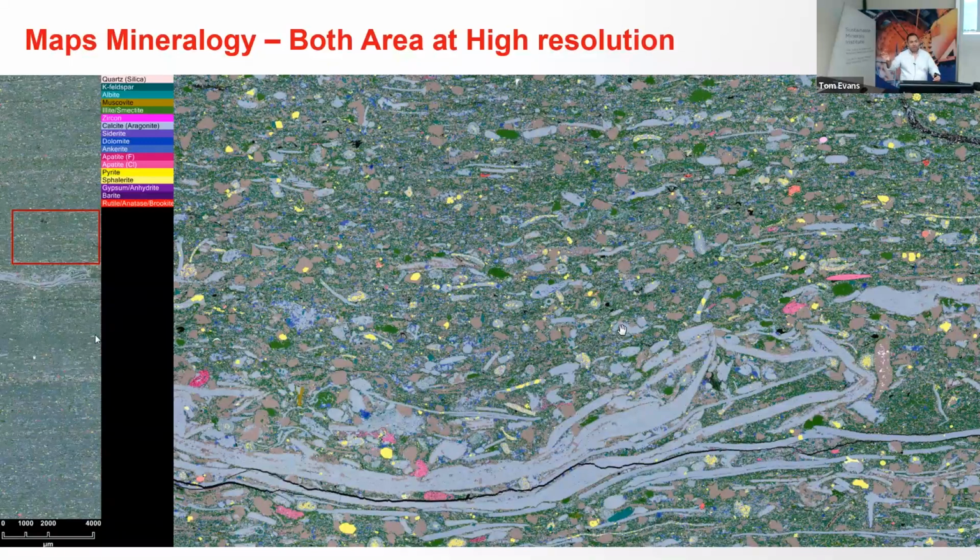And that's the reason we are working on a lot of automation to basically go through the entire workflow in a more automated fashion. So even though the classification takes longer and we are dealing with larger file sizes, most of the process happens unattended, and more of the things happen in parallel compared to in a sequence. That's what we used to do in the past.